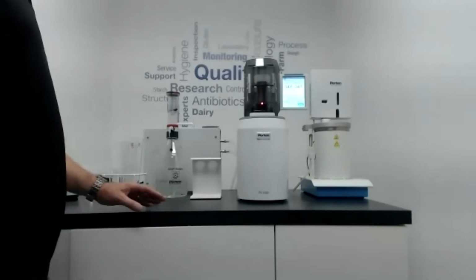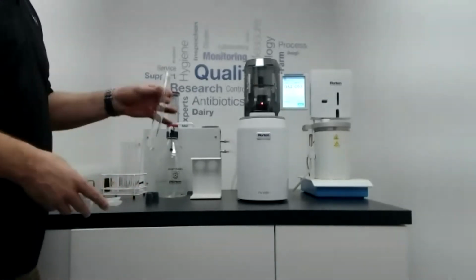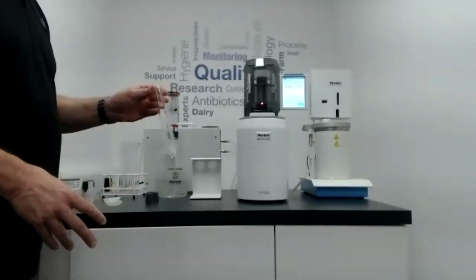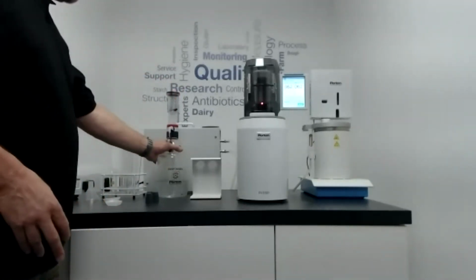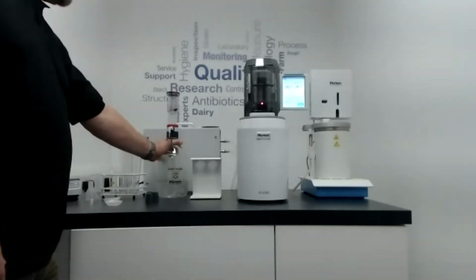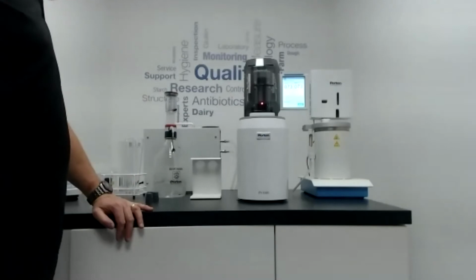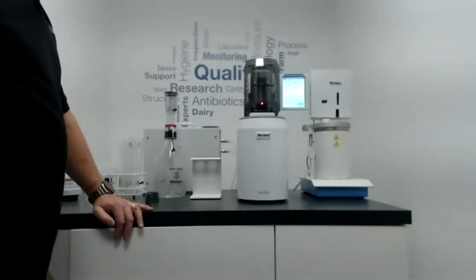While that goes off, to ensure that your tubes are clean and dry before use, that there are no breakages on them. Quite high tolerance tubes. You need to make sure, like I said, your water is replaced daily with freshly distilled or deionized water. And I'll show you after the test how we can check that the stirrer itself is still fit for use.